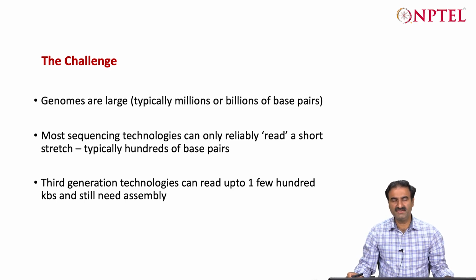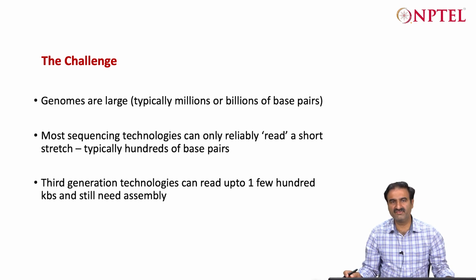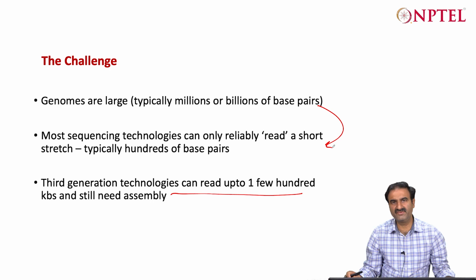In genome sequencing, the major challenge is that there are so many genomes available for sequencing, and their length is not a few hundred or thousand base pairs, but millions and billions. For example, a bacterial genome is 4 million base pairs, whereas a eukaryote is half a GB, or half a billion to several billion, 3 to 4 billion base pairs. In the case of the aloe vera plant, it is 16 billion base pairs, which is very long. So we cannot use first generation sequencing technology, which gives only 800 base pairs, and we have to use massively parallel or contiguous sequencing assembly technologies. Third generation has come recently, which is very good, but most of these genomes have been done by second generation sequencing technology.